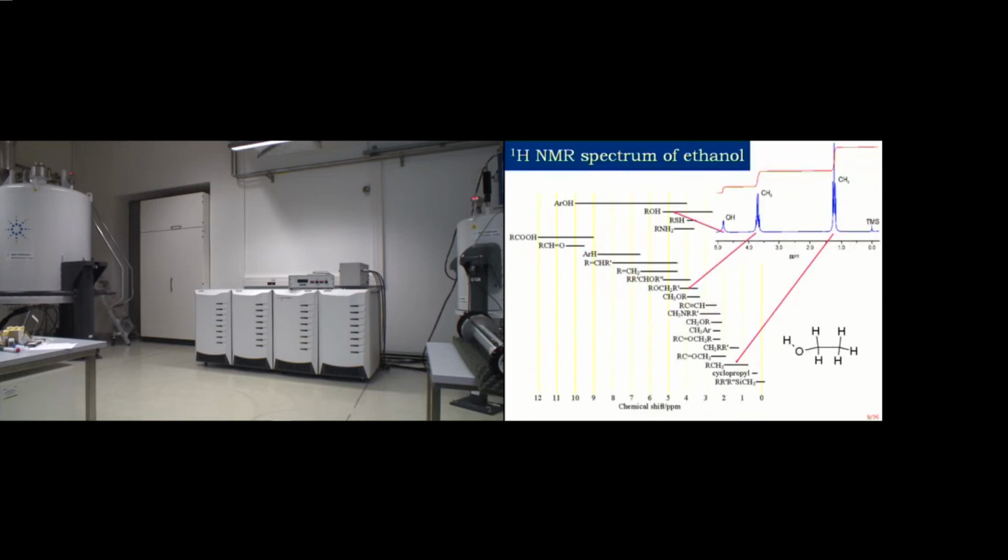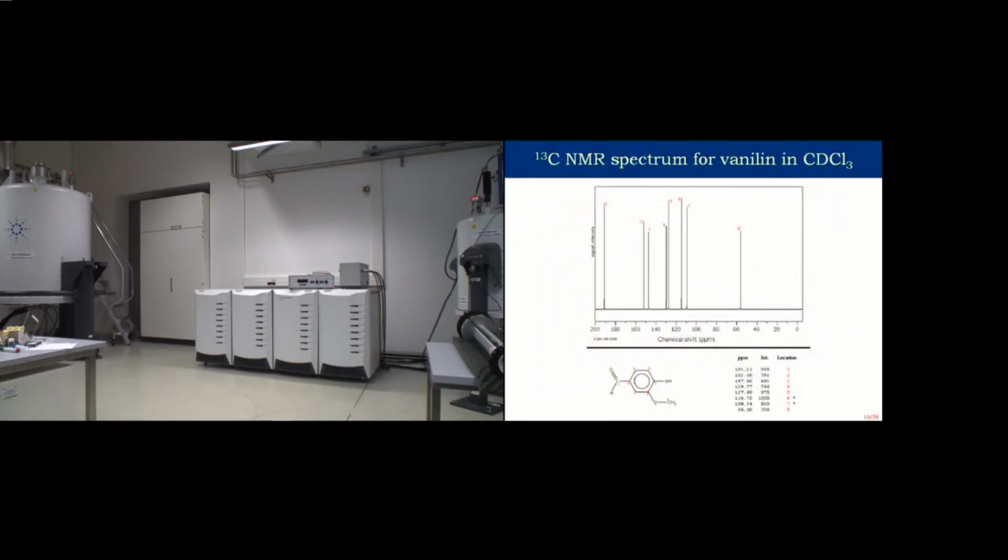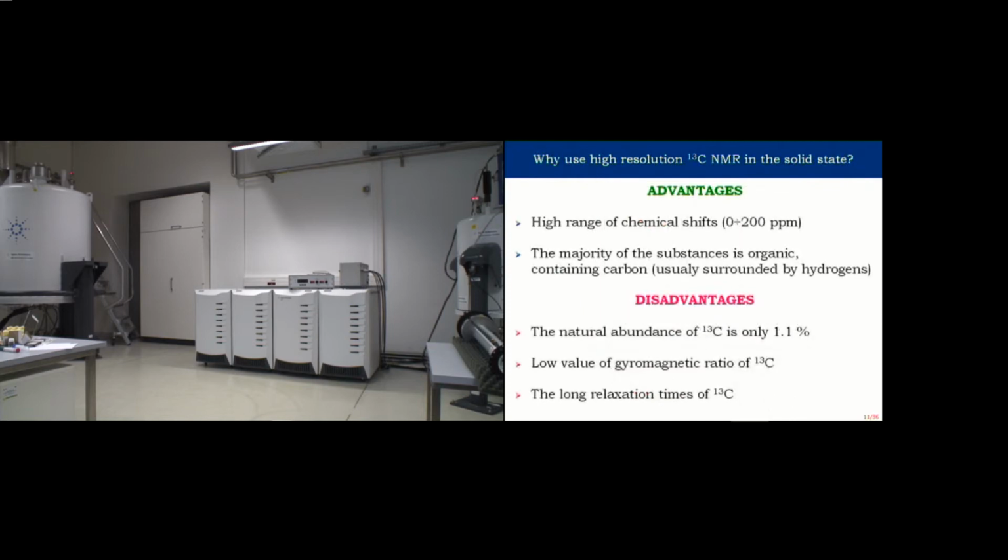It is easy to imagine that as scientists, we use tables collected together from all over the world, allowing us to find the position of each line, especially if we don't know what we cooked in the pot. This is a very widely used method to study the structure which we try to achieve. And now I would like to go to the main topic of this presentation.